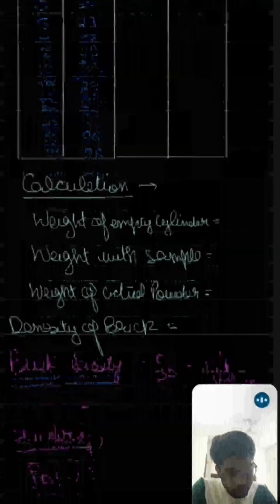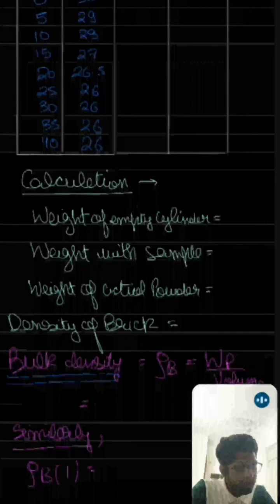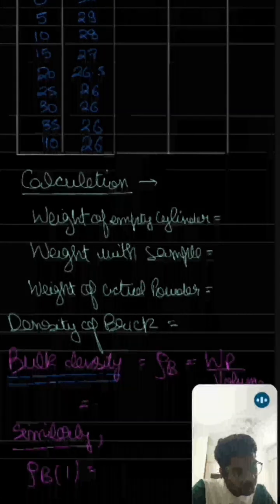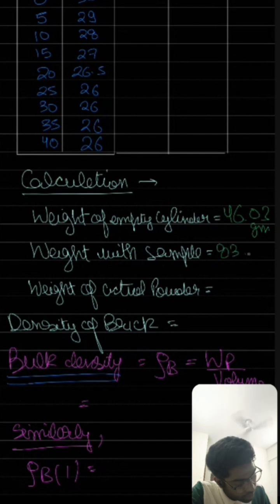For doing this, we will firstly note down the weight of the empty cylinder, which is found to be 46.03 grams, and the weight with sample is 83.12.